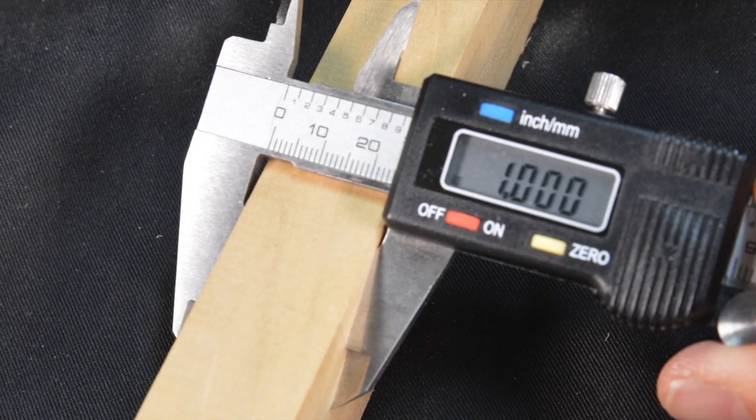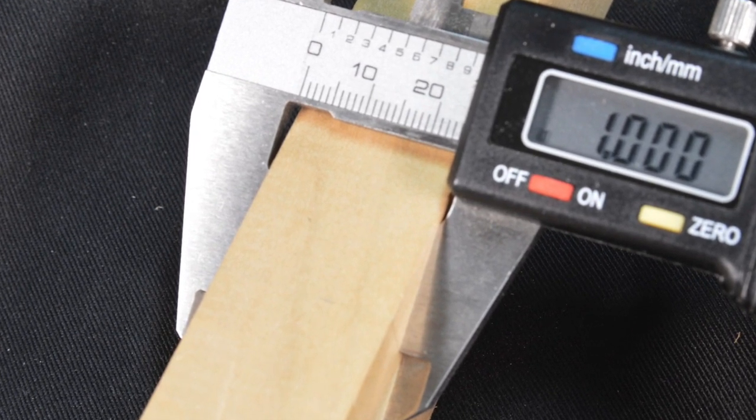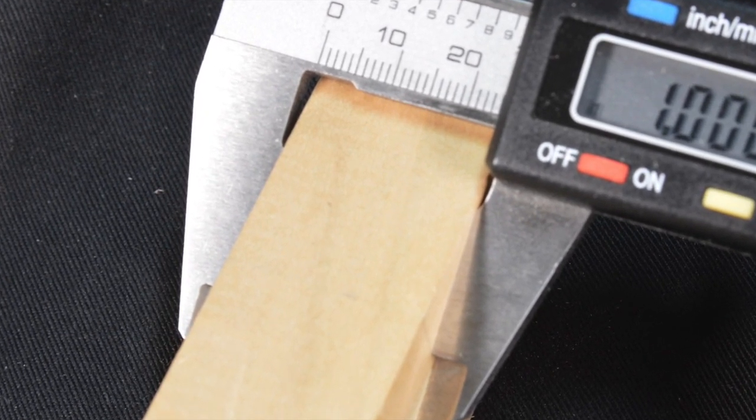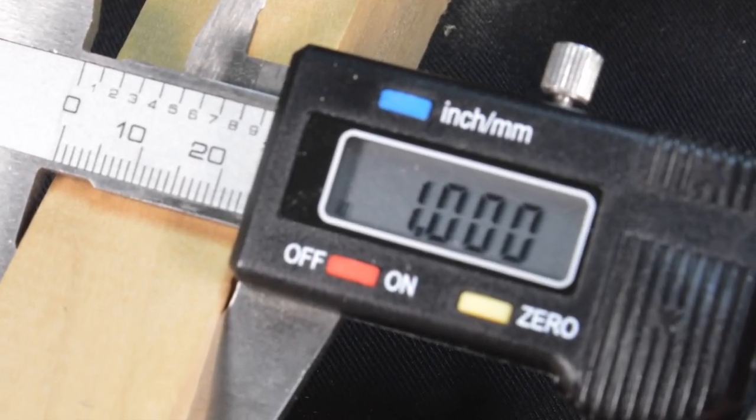To make an outside measurement, slide the jaws open and place the item to measure between the outside measurement jaws. Slide the jaws together until they gently contact the item. Read the measurement on the LCD screen.